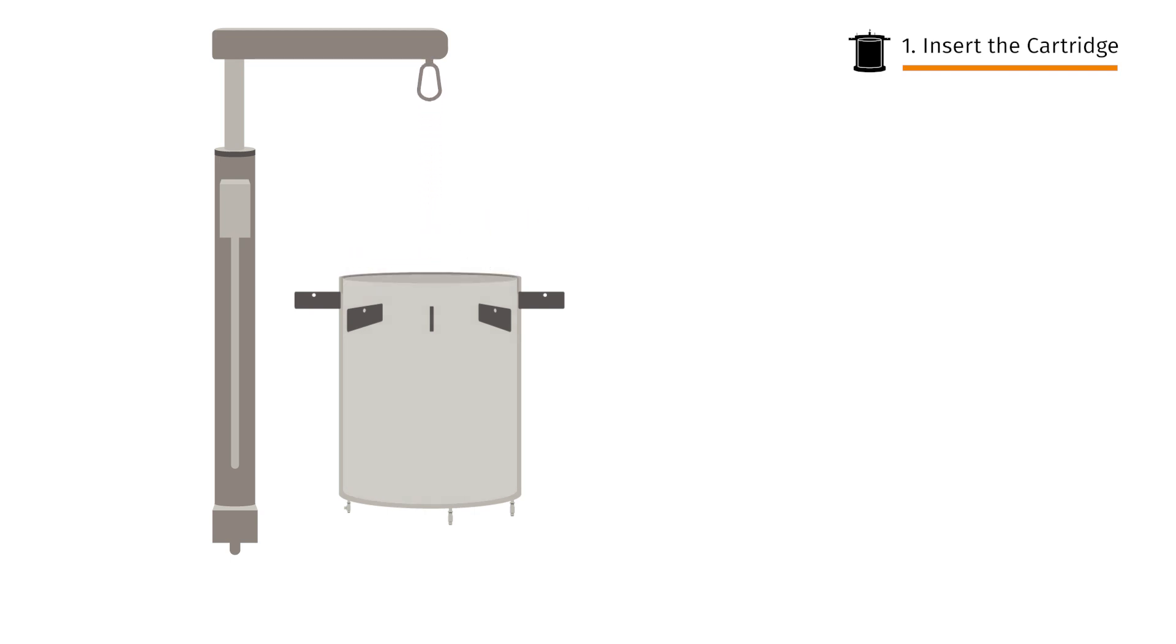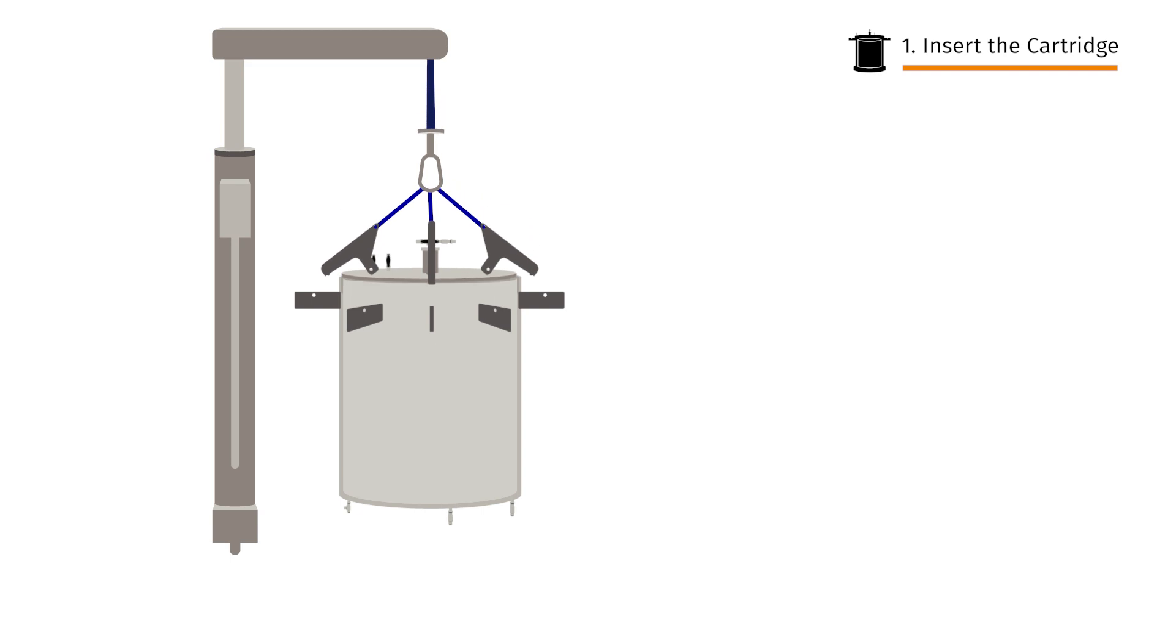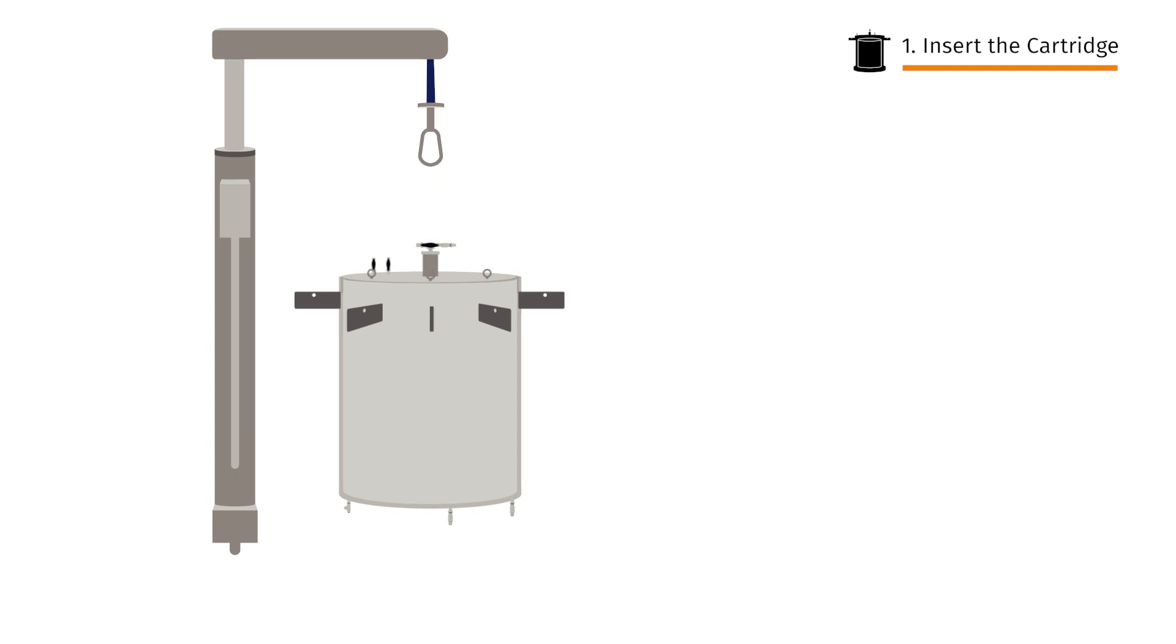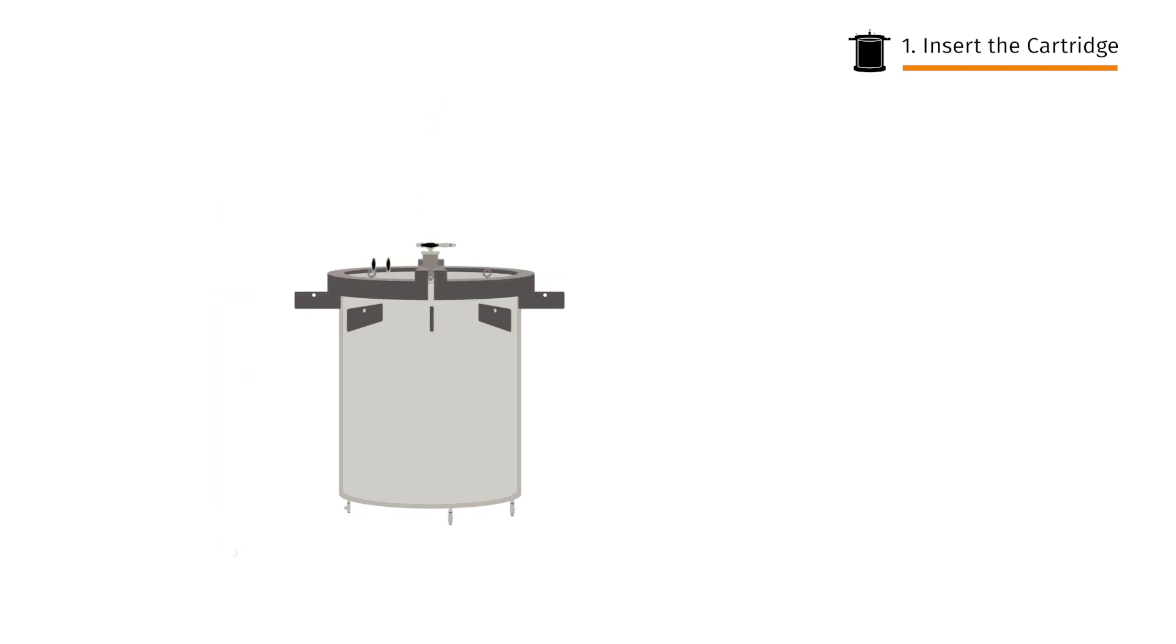Then use the hoist to lower the head into position. Rearrange the head sling assembly, tighten the head and secure it with retaining clamps. Our cartridge is now ready for use.